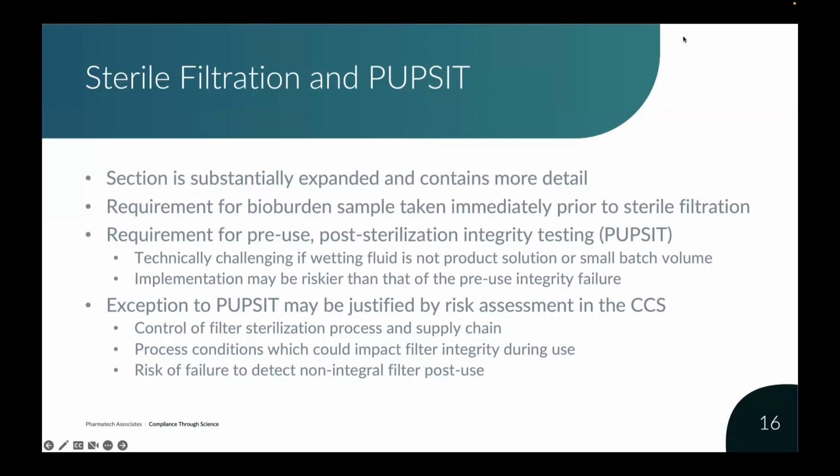This is probably one of the more interesting or controversial aspects. Currently, the FDA doesn't require this, but the EU now has added this: the pre-use post-sterilization integrity test. That means that after it's either autoclaved or gamma sterilized, but prior to use in the process, you have to do an integrity test.